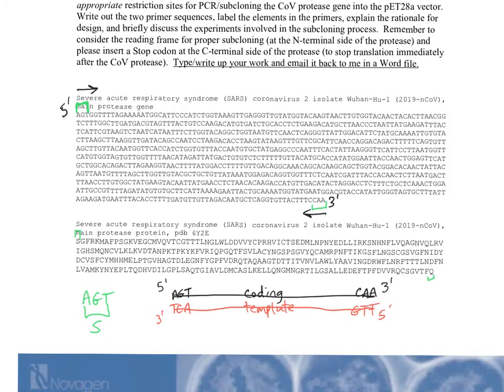That's the code we're looking at for the actual codons and then therefore the amino acid sequence. So that's the gene itself. Now we're going to put stuff on the ends of these, all right? So we're going to end up putting some stuff here to subclone this out. But I'm trying to get you guys to kind of visualize what we're doing here, okay? So this is the gene.